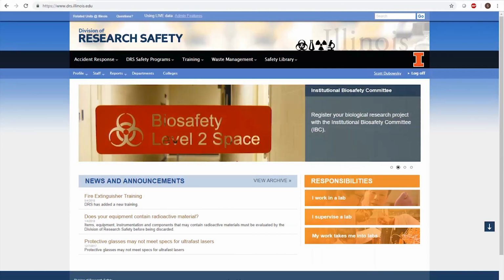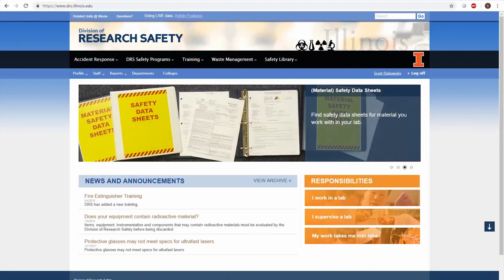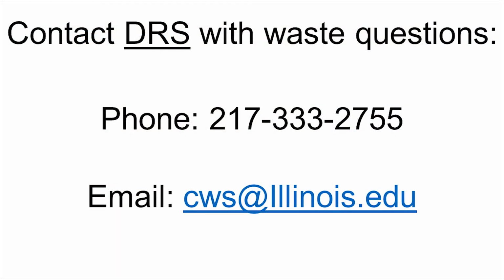If you are unsure about potential hazards of waste, have a particularly challenging case, an unlabeled container, or are not sure what to do with your hazardous waste, please contact us at 217-333-2755 or at cws@illinois.edu. Thank you for your time, and be safe out there.